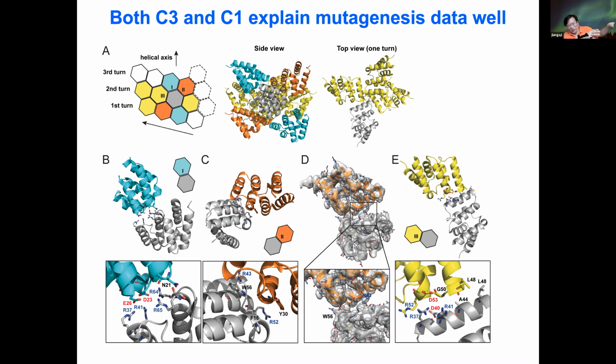We then used the C3PO complex to demonstrate this point, that using this grid would not restrain the freedom of orientation for individual molecules. Using the images, we can build a three-dimensional map without any problem. It turns out that if we compare it with samples sticking to the surface of the carbon, our method is actually better because of the spacing effect. So we don't have that problem.